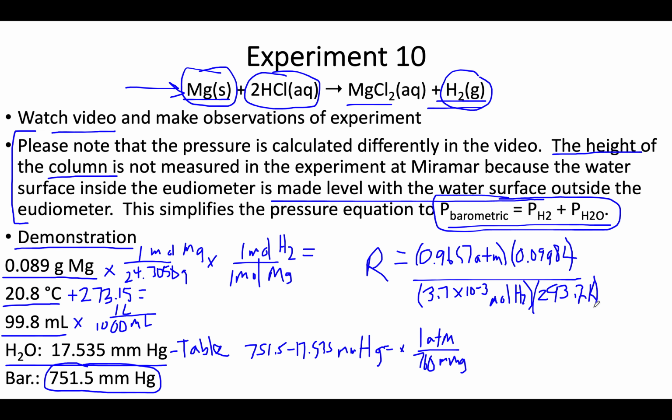So this is the demonstration that I did last year for the class, trying to talk while doing the experiment, do some calculations. There's bubbles that can happen, pieces of metal can break off, so lots of things that can happen, but this came out with 0.089 for the constant. So that's pretty good.